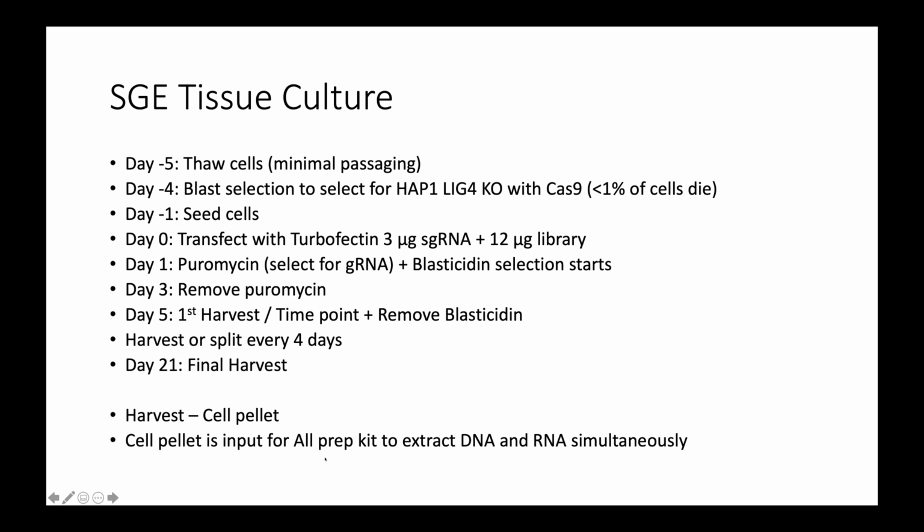And the premise is then you'll be able to take those DNA and RNA nucleotides and sequence them, because they will represent the population of variants present at each of these days.